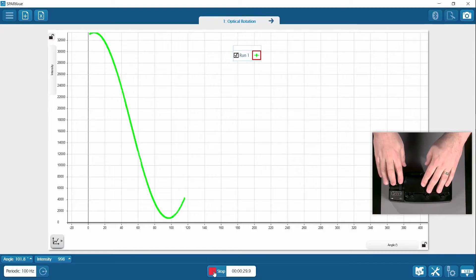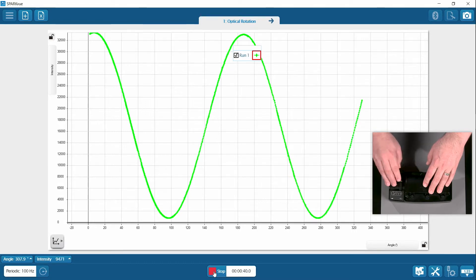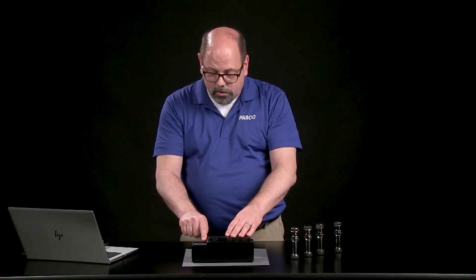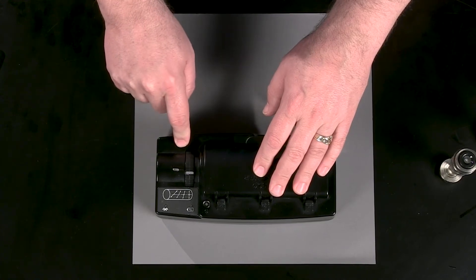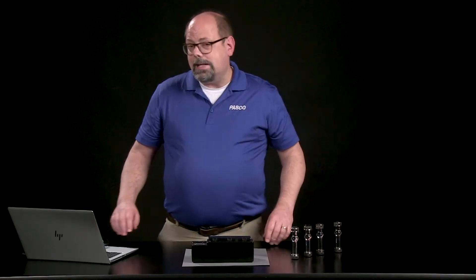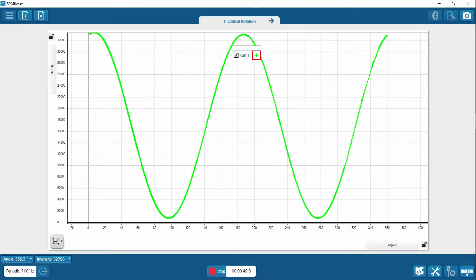I'll keep rotating through. There's a maximum—the light through the first one is making it through the second one. I'll just go all the way until I'm rotated one time through, 360 degrees. I can see on the rolling wheel itself. I'll rotate just a little past the starting position. All right, that's the data I need. Let's go ahead and stop this collection.